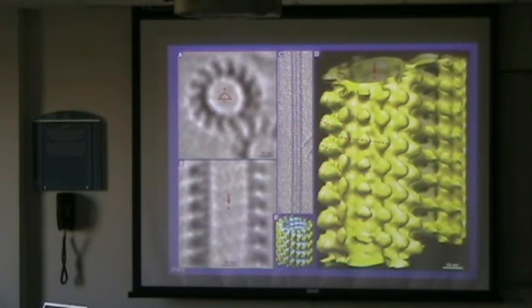So this is this interruption in the microtubule which screws up our helical reconstruction with most microtubules. That's why we use this 15th and not anything else, because we have this interruption, and that's not visible at first glance. So you have no chance to see where this is. But now we can see that, and now we can actually get these things back.